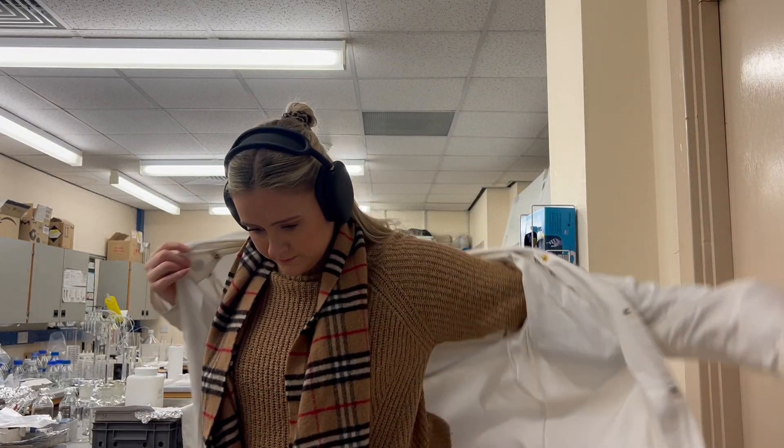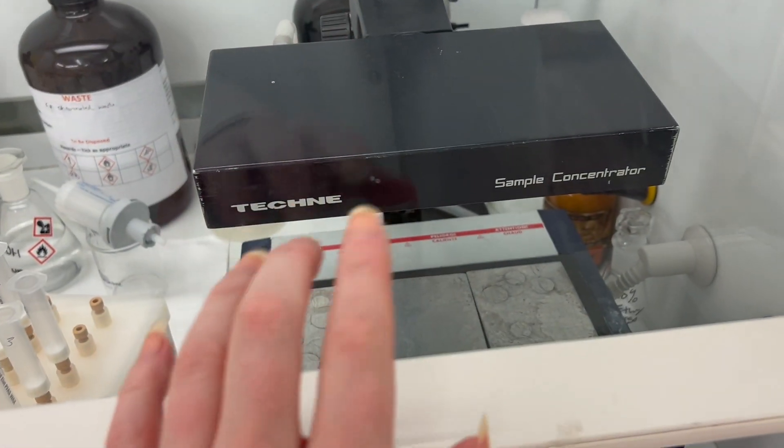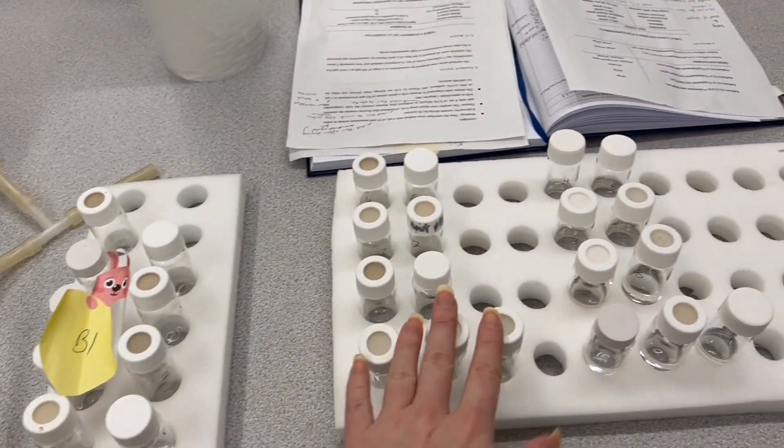I really need to work on that grant. I want my supervisor to have a look over it and give some comments, and I want to give them enough time to do that. So I ideally want to get it finished this week. Just switching on the hot plate so I can use the nitrogen to dry my samples. I had three batches — batch one, batch two and batch three.